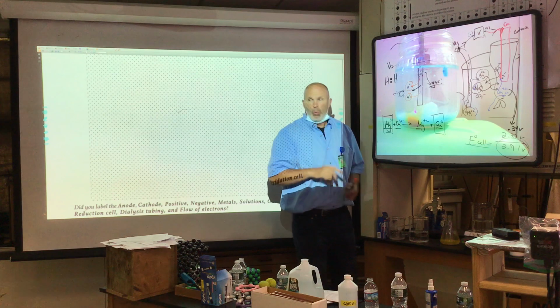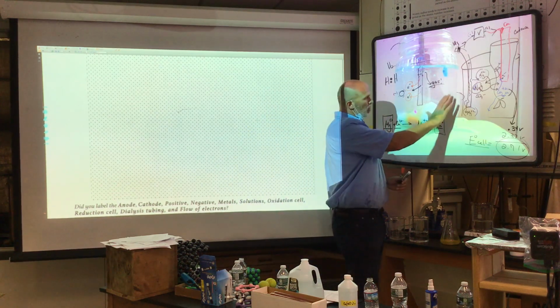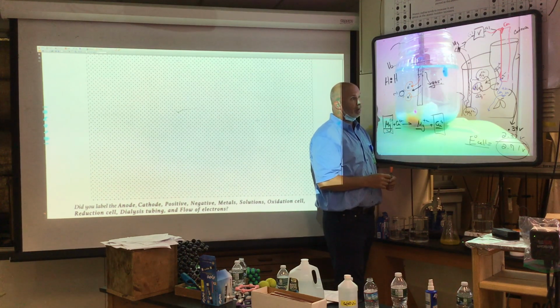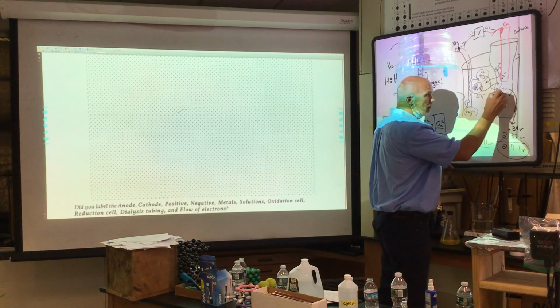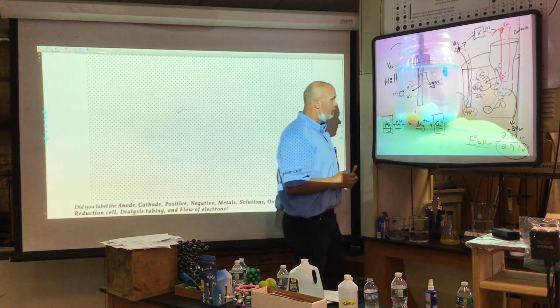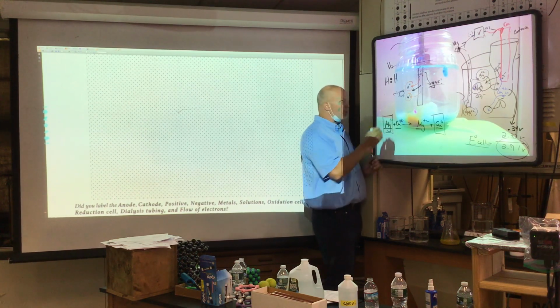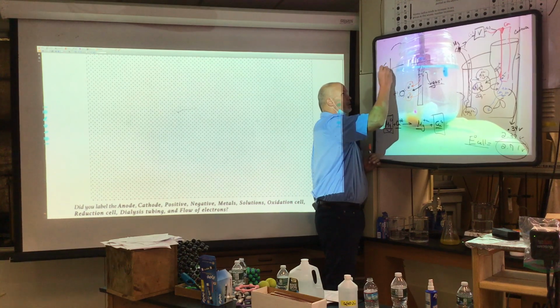Okay. What other errors? I'm going to give you some hints. Well, this is blue, isn't it? So, copper plus 2 was diffusing out of the bag, wasn't it? Okay? So, if copper plus 2 concentration, the Le Chatelier's principle, here's the stress response.